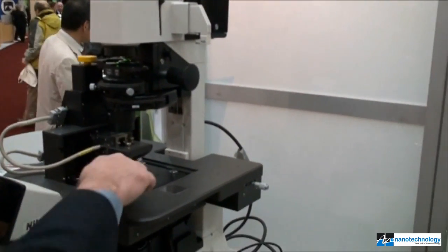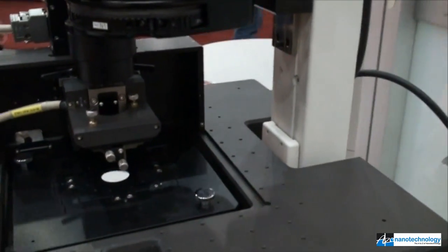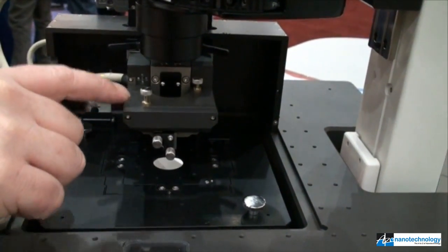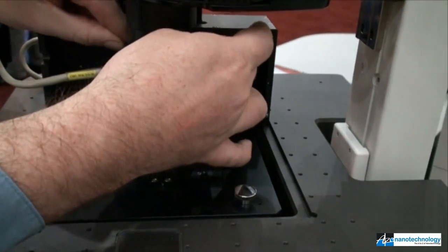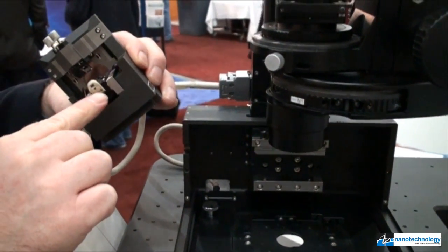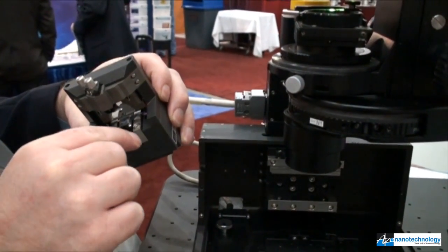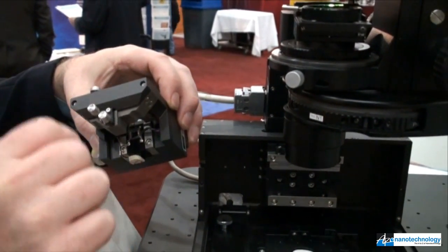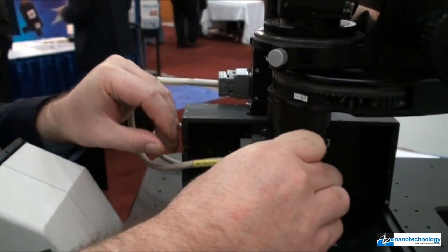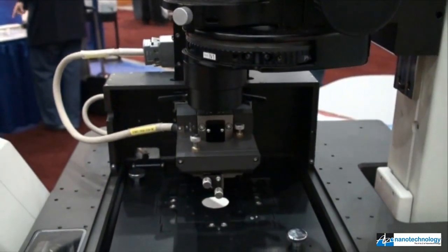Like all of our other XE products, this system is designed with a completely decoupled XY scanner from the Z scanner. The sample will be mounted on the XY stage and scanned, rastered in the XY direction. The probe itself for the AFM experiments is mounted on the Z scanner, which is easily detachable for changing probes from experiment to experiment. The probes are mounted on the bottom of this probe hand — we actually have a liquid probe hand on the system right now. After changing the probe, we can easily slide the scanner back on this dovetail rail and lock it into place.